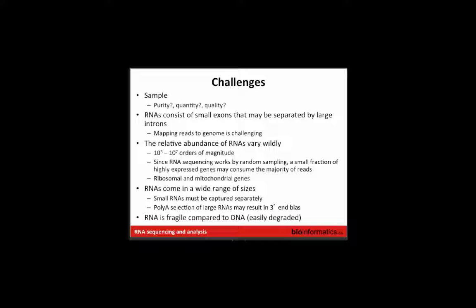If our gene of interest is something that's really highly expressed, this is great. We don't need that much data to get good coverage of that transcript. But if we really want to characterize the whole transcriptome, or we have particular interest in certain lowly expressed genes, then this is a big problem because it's going to take a lot of sequence depth to get good coverage on those transcripts. People are usually surprised at how bad this problem is at first. The transcriptome on its face seems like a small space. In human, for example, it only occupies 1 or 2% of the genome. So you might think it won't take that much data to cover the transcriptome, but this basically kills that idea. It's almost like sequencing a genome because of this issue.